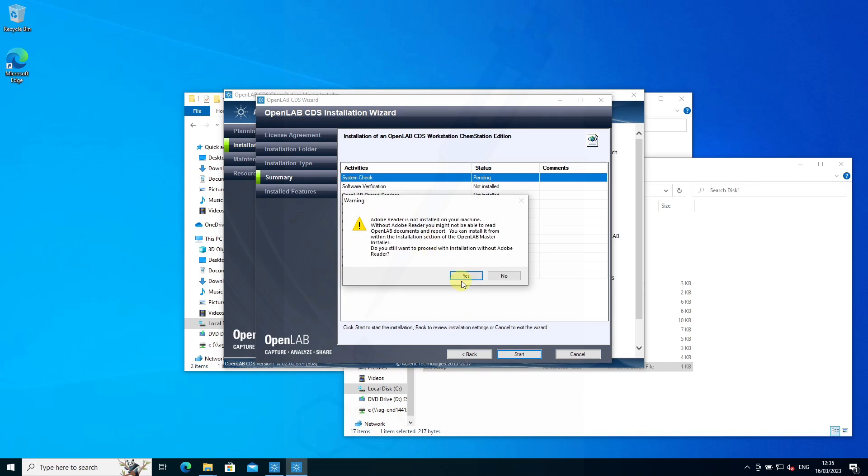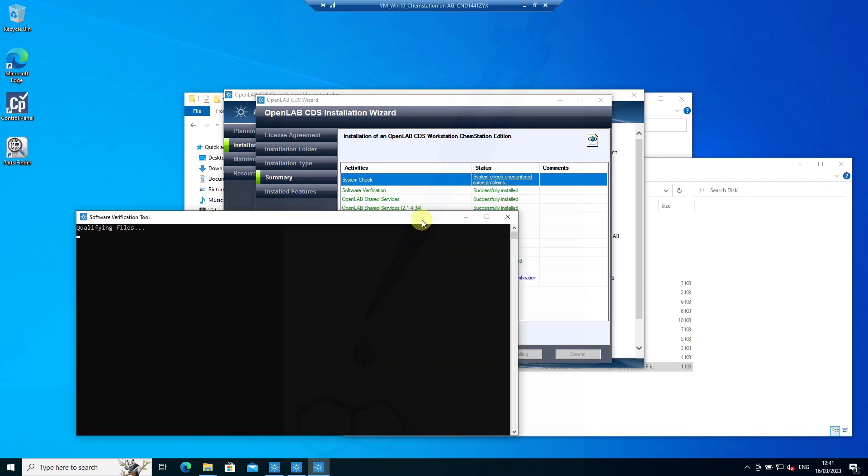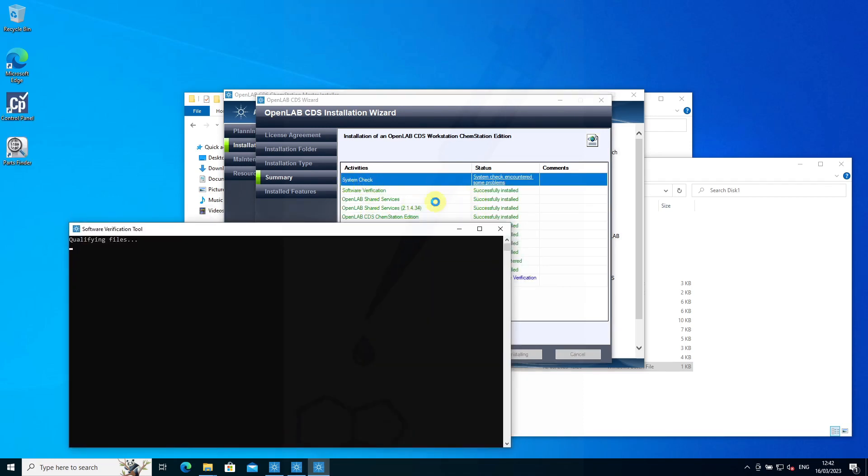We get an error message saying no Adobe Reader is installed. That's okay, we've got Edge. Some system checks are run before install can happen, and you might get a report highlighting errors that need to be addressed.